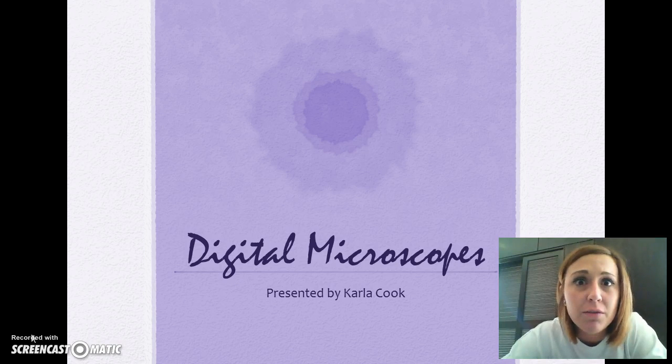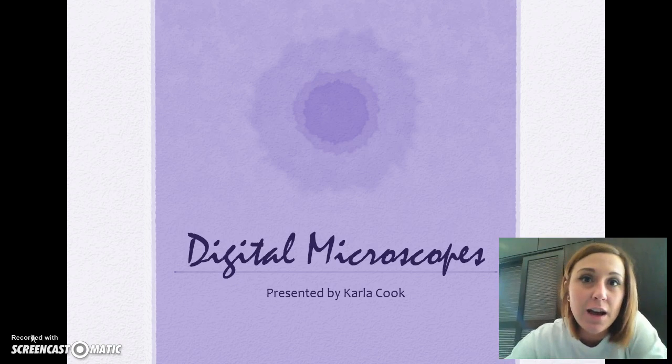I forgot about this workshop I was coming to for Understanding by Design through my school. But I just wanted to go ahead and present you with my digital microscope, what I did my research on.